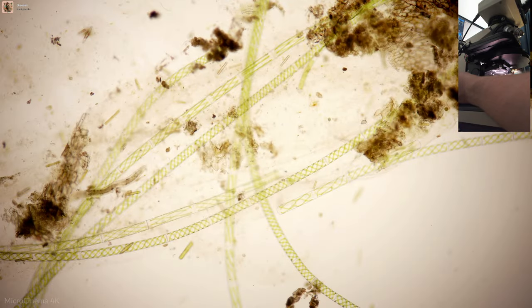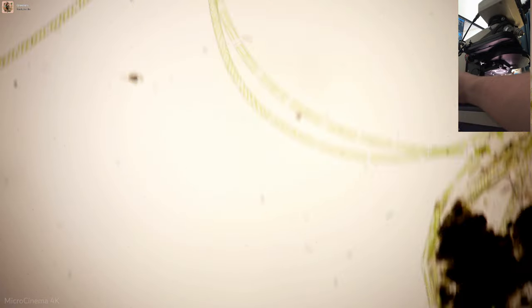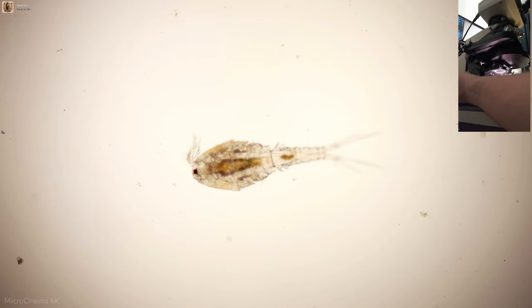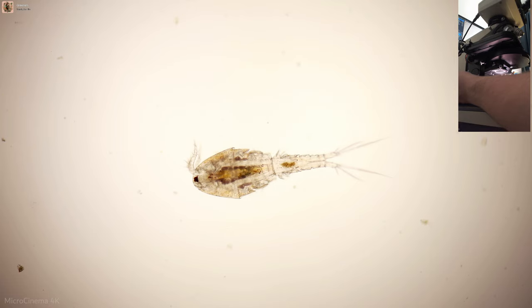Well, I really like dark field for certain subjects, especially things like copepods. I think they look amazing in dark field.